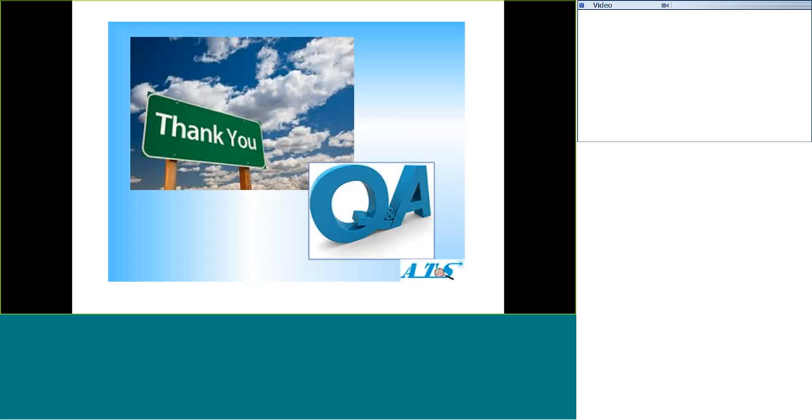I see. Good. I'm happy that there is another application for Raman: thermogravimetric analysis, TGA, is possible coupled with the Raman. And also for inorganic oxides, like the titanium oxide that I showed you in the presentation here. Titanium oxide, calcium oxide, calcium carbonate, they are all very sensitive, so you can detect minerals too. Yes, it's good. I have quite a lot of minerals, gems and all this. You can detect them with a sharp spectrum, like diamond, rubies, all those could be detected.